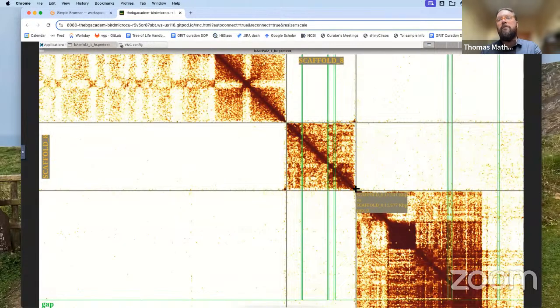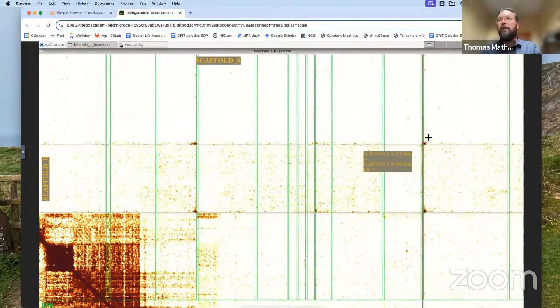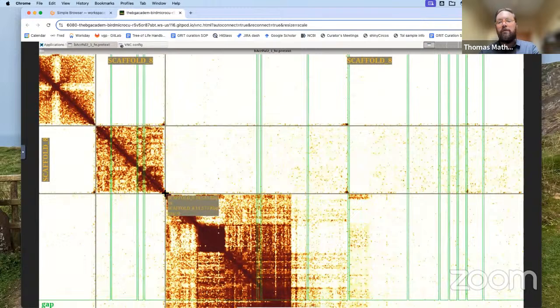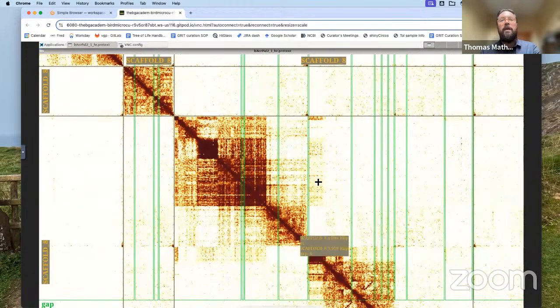If you zoom in, you can actually see here, this is another useful signal. So at the end of the chromosome at this end, you see this blob of contacts, which corresponds to the end of another adjacent chromosome here. And if you look along the assembly, you see other dots of black here. So this is actually likely a telomere sequence at the end of the sequence, which is being picked up by the Hi-C contacts. So we can see this is the one end of the chromosome. There's another one here, and as you see this sharp drop off in contact. So this one's breaking here.